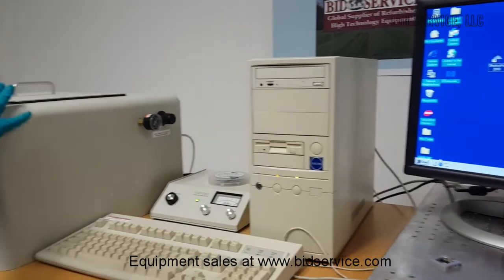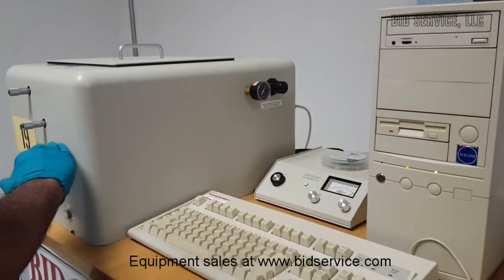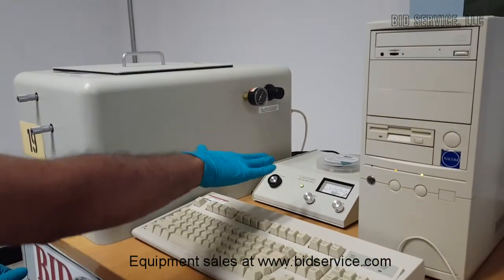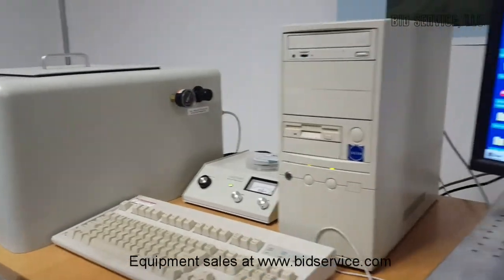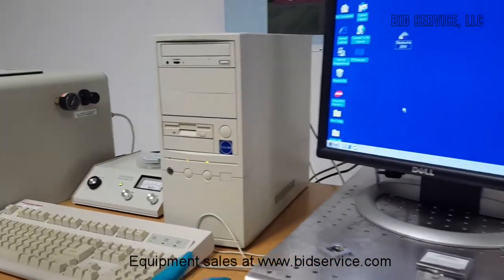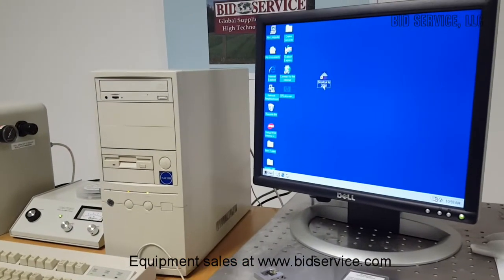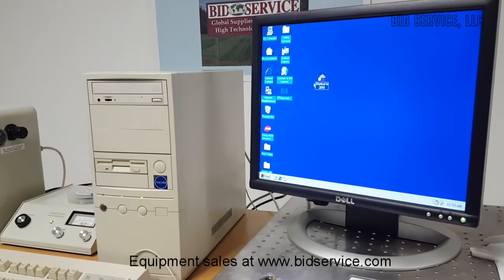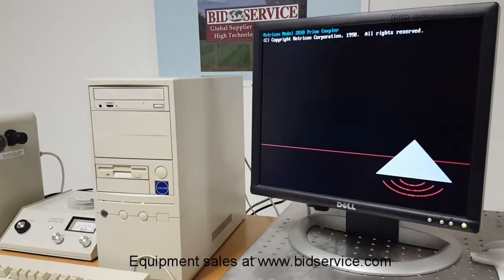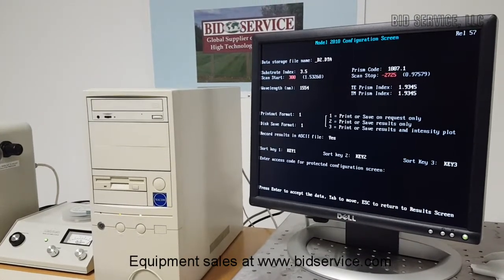This is the main system with all three lasers inside it, the Prism Coupler interface module here, and the personal computer and the monitor system. The system application is a DOS based application. By clicking on the icon, I'm able to run the application.